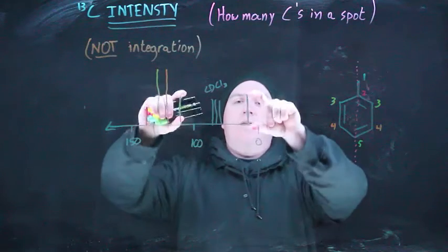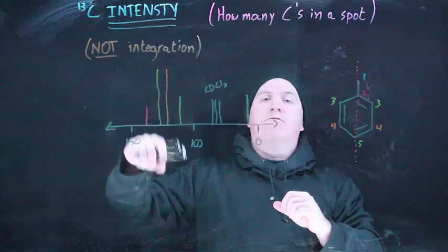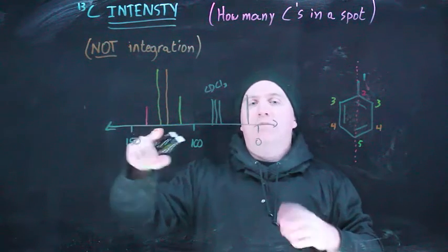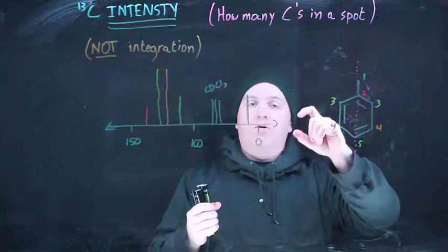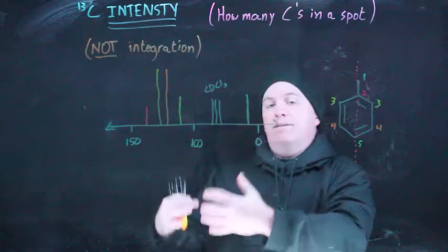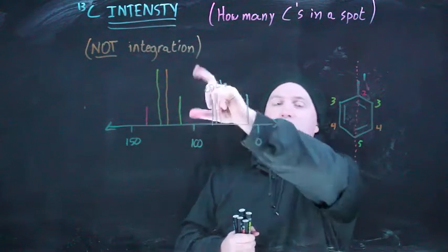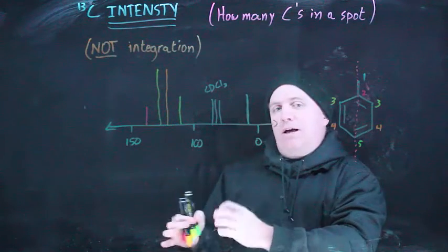So this is what a height of 1 looks like in this spectrum. This right here is what a height of 1 looks like that does not have a hydrogen attached. A quaternary carbon, for NMR purposes, is a carbon that only has carbons bound to it, not hydrogens, and will show up as extra small, again, because of the way we choose to run the spectrum. So big picture, this would be what I would expect. And again, peak height is not exactly integration, but it's a lot like integration.